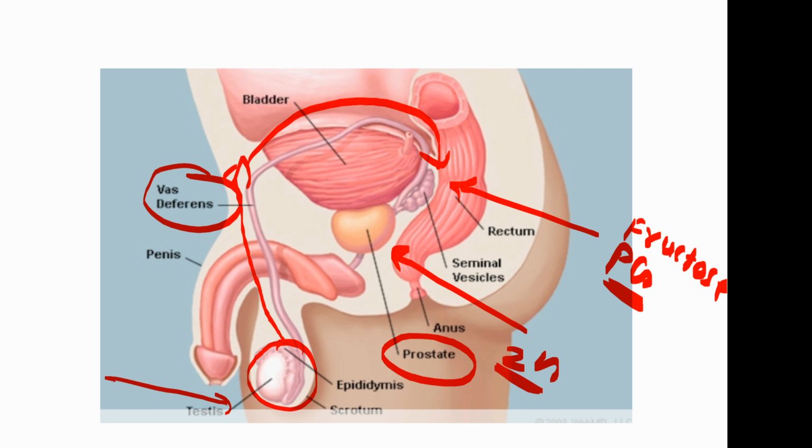The semen coming out of the urethra is very thick, so it generally takes 20 minutes to liquefy. Liquefaction is very important, and liquefaction is done by the prostatic enzymes. If the patient's semen is unable to liquefy after 20 minutes, then definitely there is either less secretion by the prostate or a blockage in the prostatic secretion.